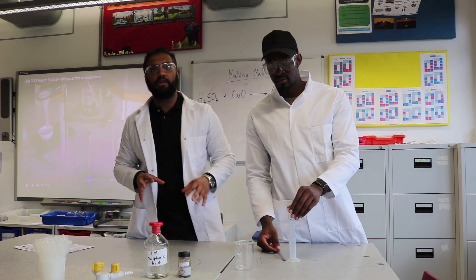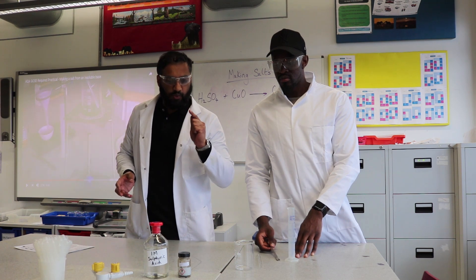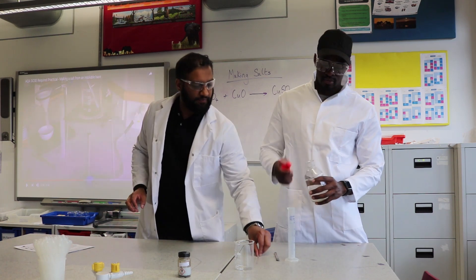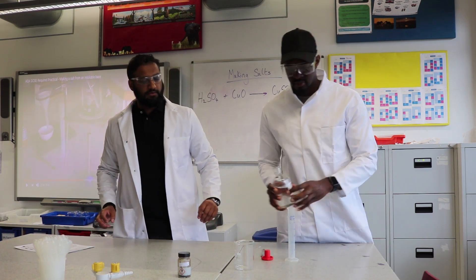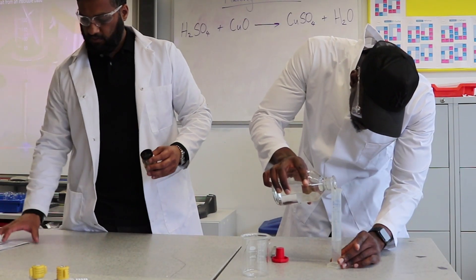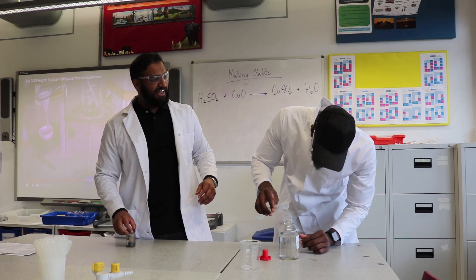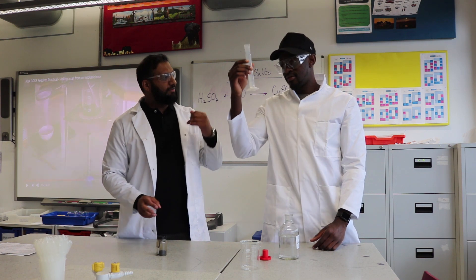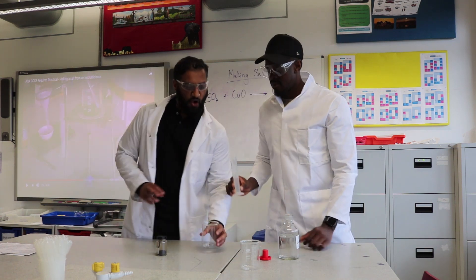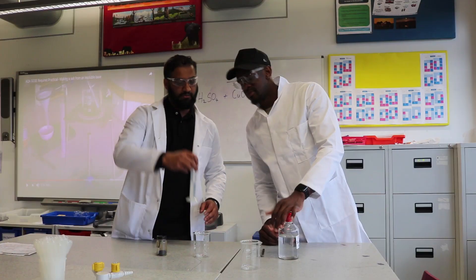We're going to start by measuring 25cm³ of sulfuric acid using a measuring cylinder. One important rule: do not put anything back into the original bottle, because you can contaminate it.